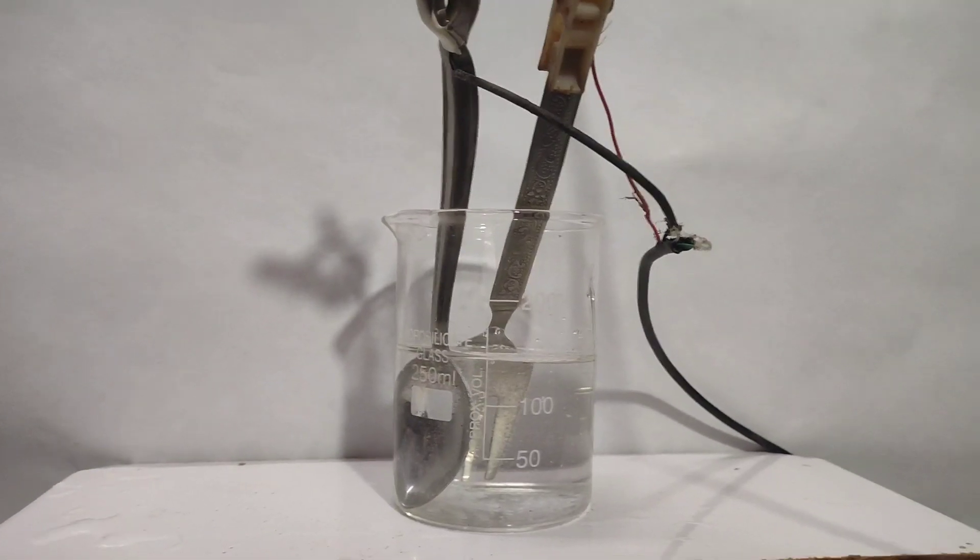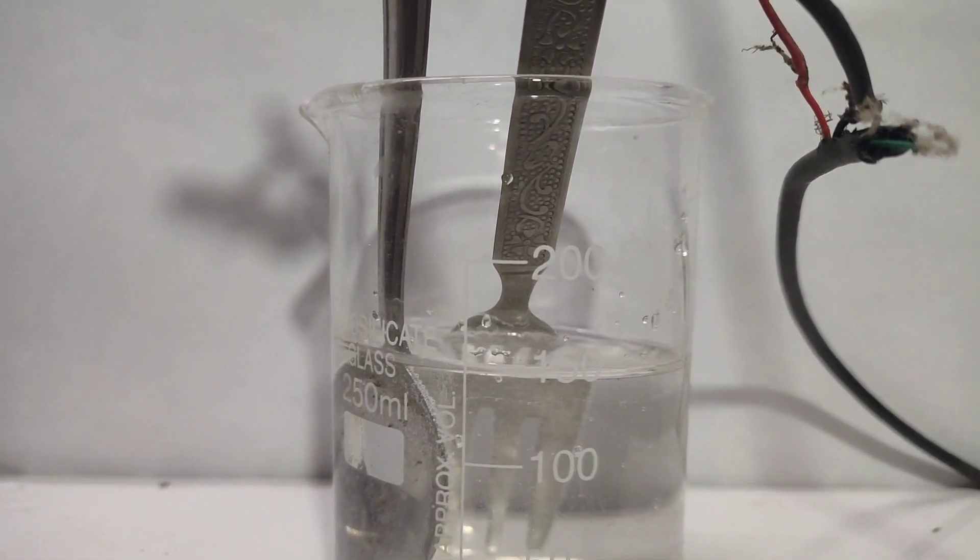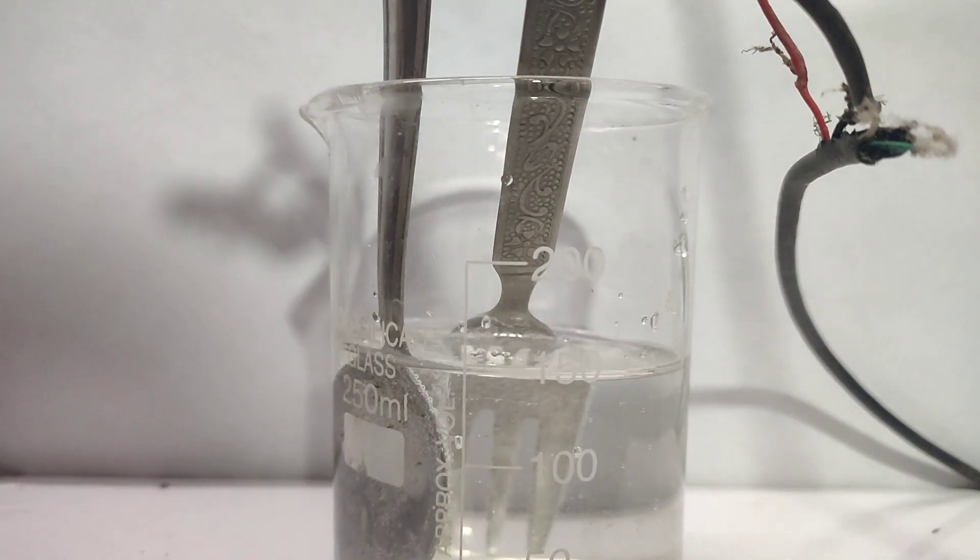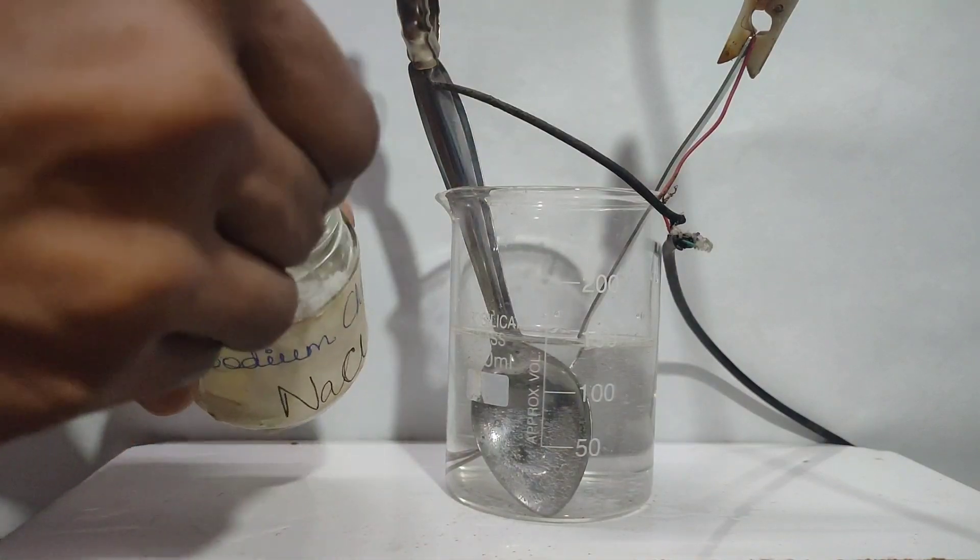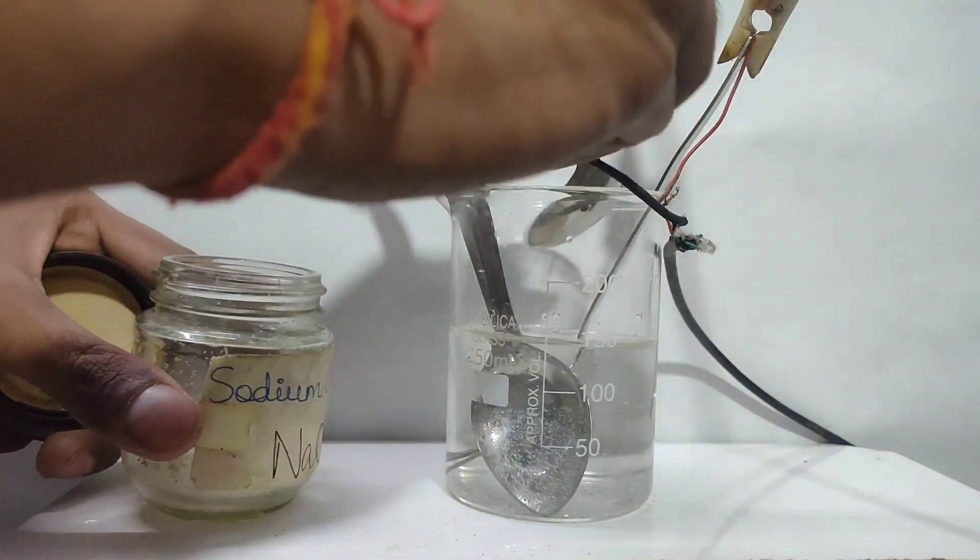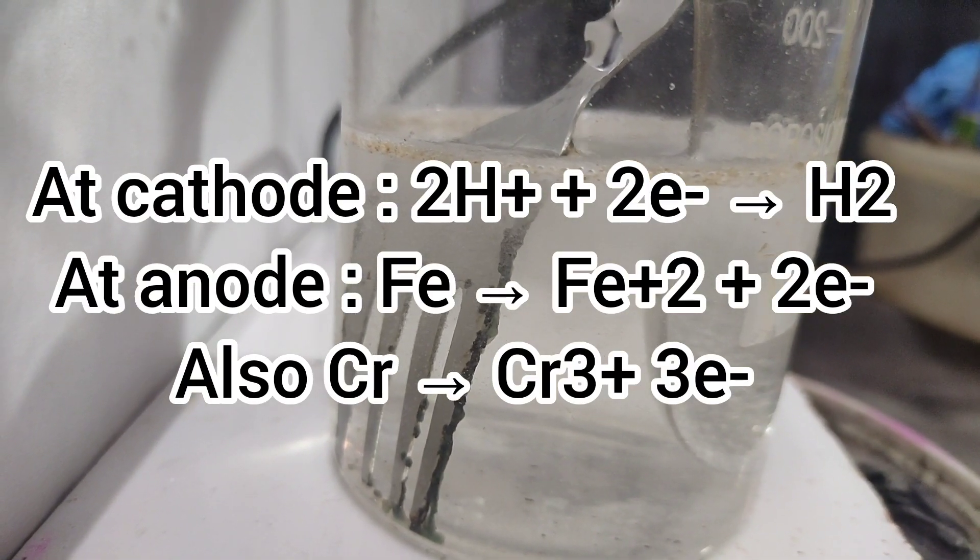I took a fork and a spoon, immersed them in the solution and connected to an 18 watt AC to DC adapter. Electrolysis started but no corrosion of anode was happening, so I am adding one spoon of sodium chloride. On adding sodium chloride, anode starts to corrode.